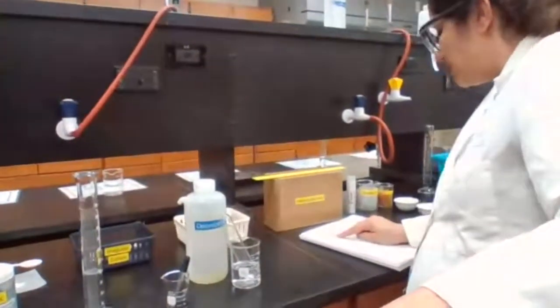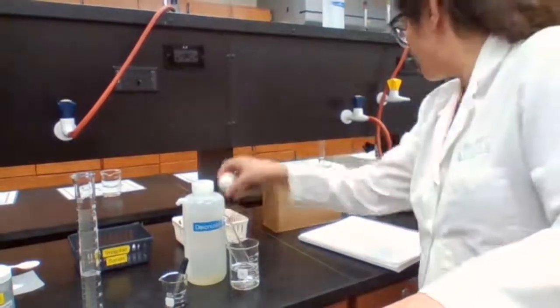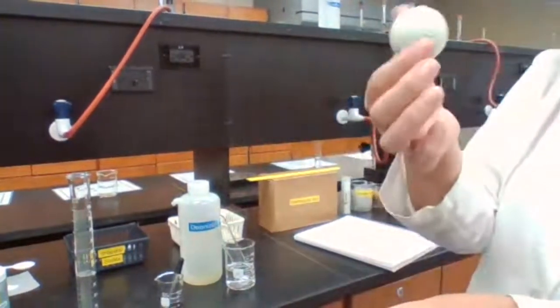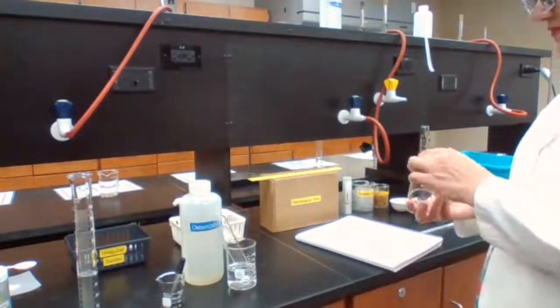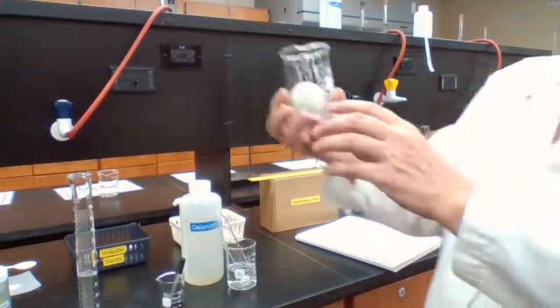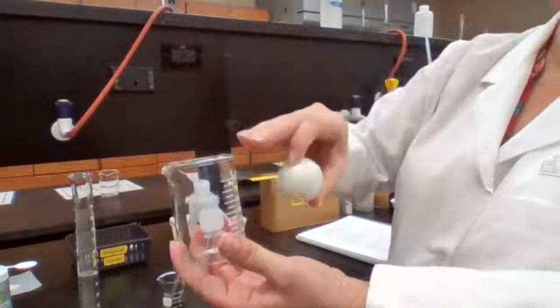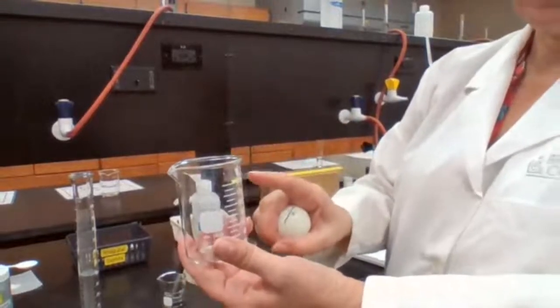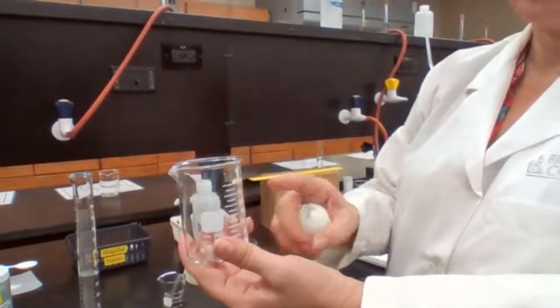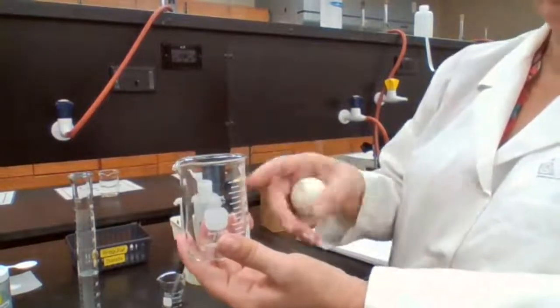Next, we want to measure the volume of a golf ball. To measure the volume of a golf ball, if I use displacement, which I've seen some students using, you put water in a beaker and then you add the golf ball into it. The level goes up by displacement and you read it. A beaker is not a good device to measure volume, so it's not going to measure accurate volume. So you're going to have lots of error in this.